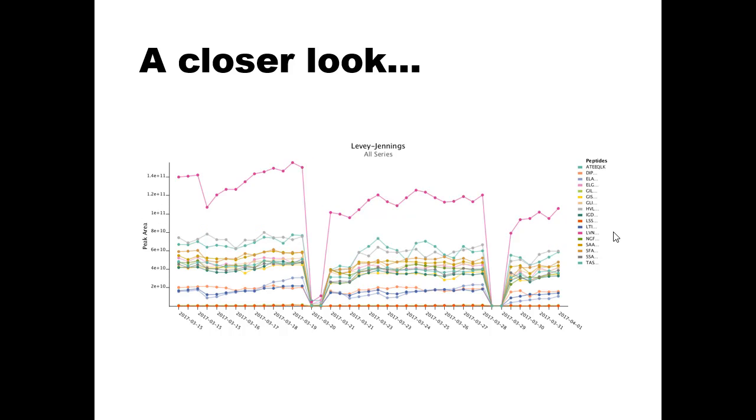So this was, I just ran out of sample in my autosampler vial. So I was drawing no sample from my autosampler vial, but this was something that I see in my AutoQC. I can tell something's wrong. It turned out to be not a big deal. I was just running out of sample in my autosampler vial.